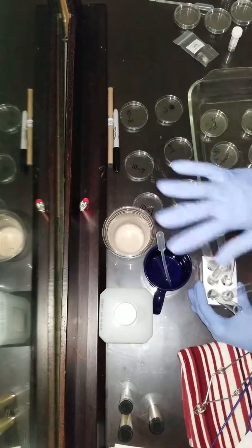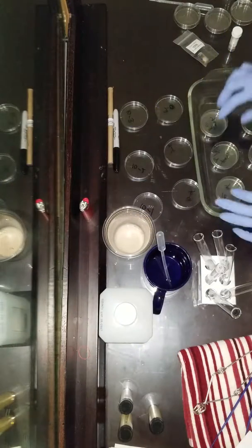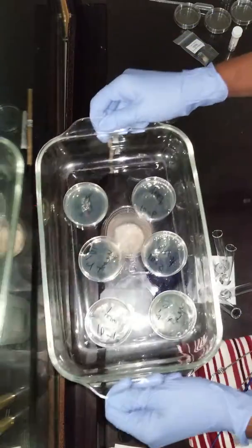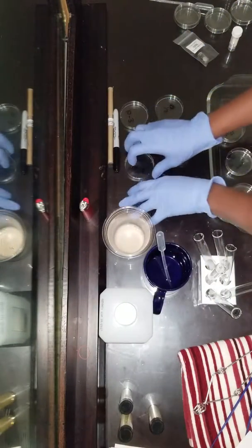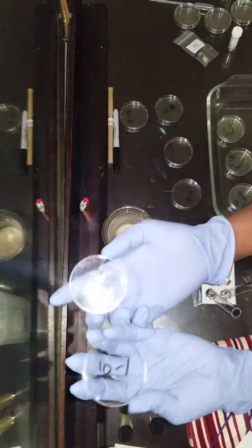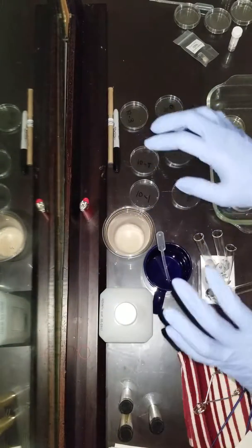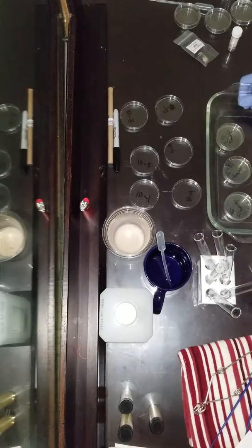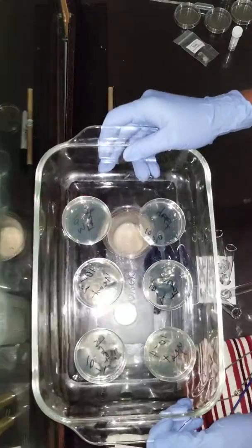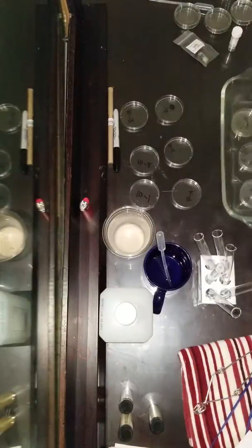Then prior to the pouring, I prepared my agar solution, which would have been in these test tubes. I labeled them, as you can see. I also labeled the covers with the respective numbers, 10^-1, 10^-2. And then I poured the agar solution into each petri dish.